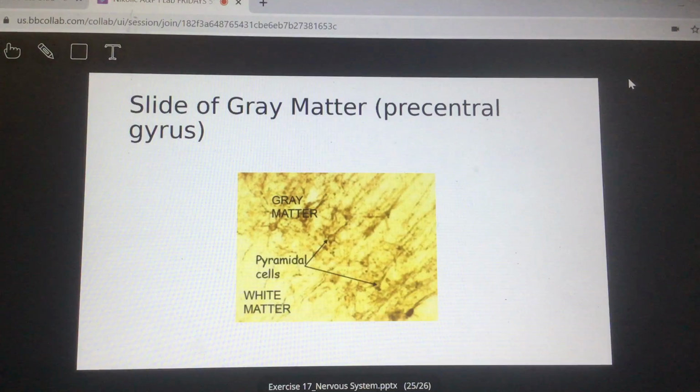But what you see here is that they are in the shape of kind of like this shape for the neuron. And that's the pyramidal neuron. So the pyramidal neuron cell body with nucleus, that's what you're going to see here and here. And it's very, very easily recognizable on the blackboard image. This one I pulled off of soft chalk a while ago. So that's what you have here.